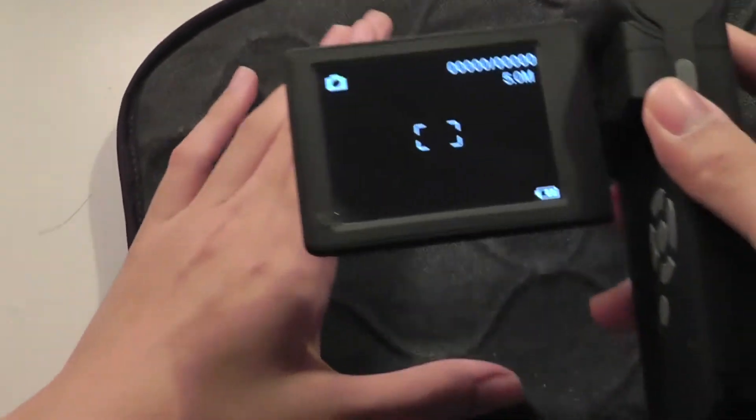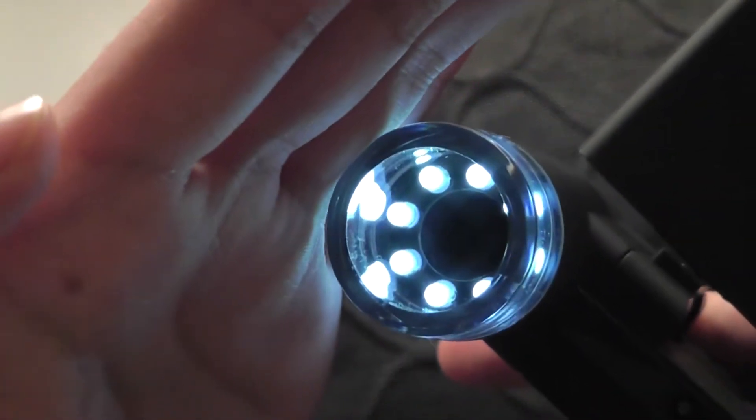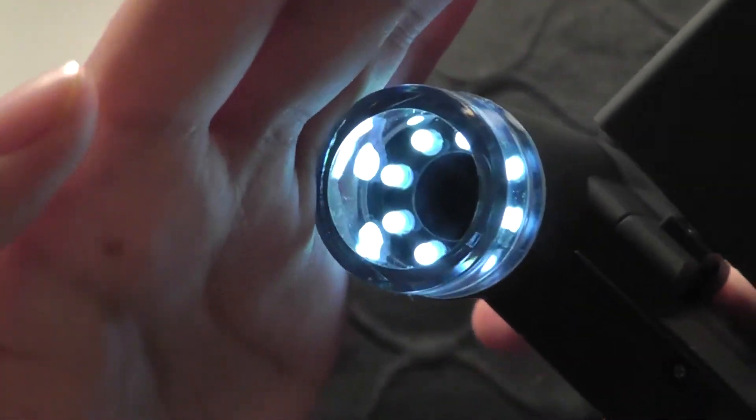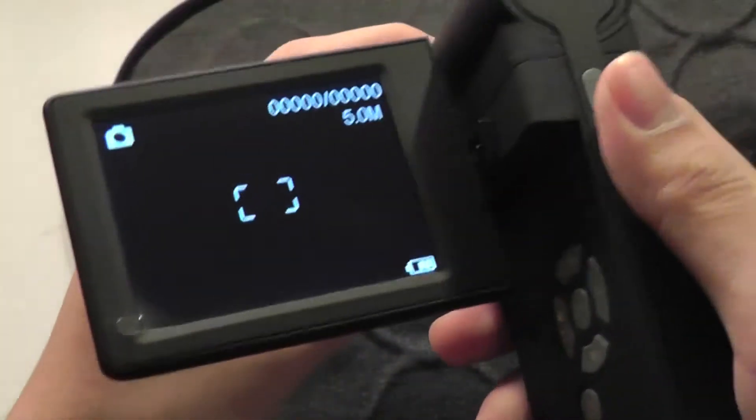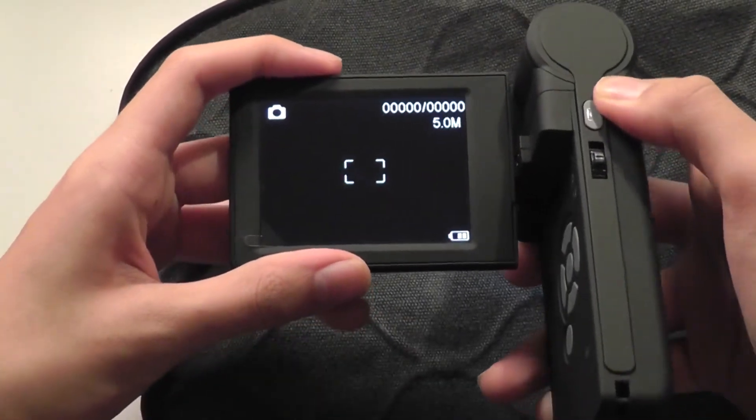If we try to zoom into something for demo, we have a pack case. This is an exo-mesh material built in here. You can see how the indicators or the LEDs have been illuminated. They also work for darker environments and also for brighter environments. There's also an IR built-in as well, so it will be pretty easy to use.